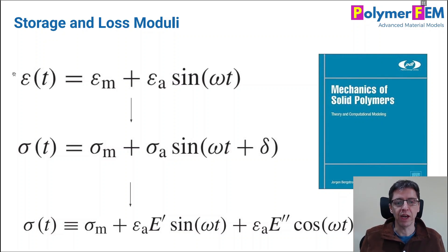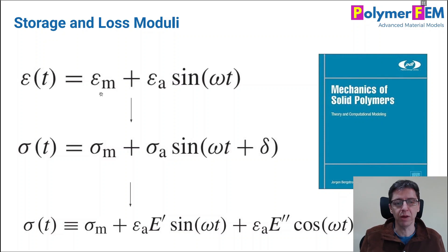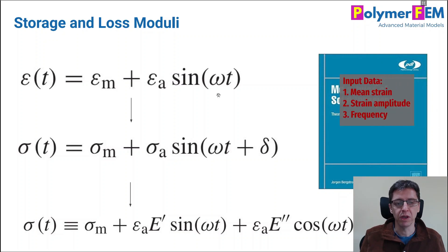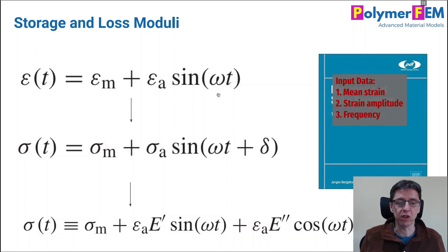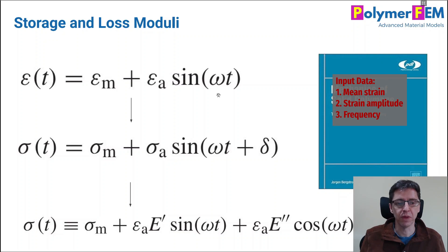So if you want to analyze DMA data of frequency type, you really need to know the mean strain, the strain amplitude, and the frequency of course. Perhaps also the temperature if that's something that's been varied in the test.